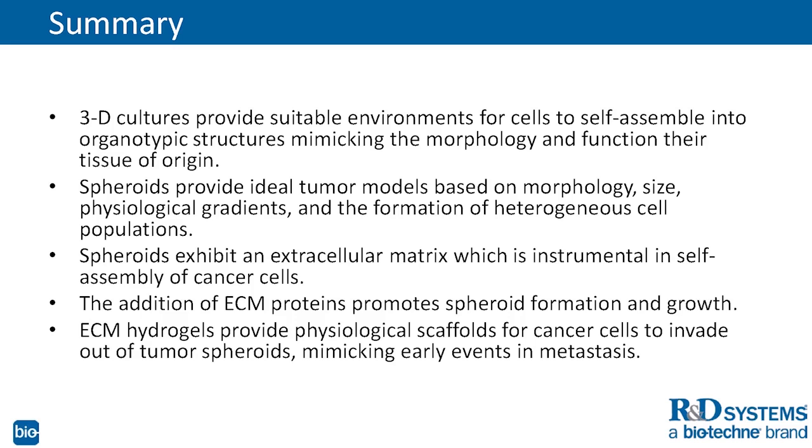Spheroids exhibit an extracellular matrix, which is instrumental in the self-assembly of cancer cells. The addition of ECM proteins promotes spheroid formation and growth, and ECM hydrogels provide physiological scaffolds for cancer cells to invade out of tumor spheroids, mimicking early events in metastasis.